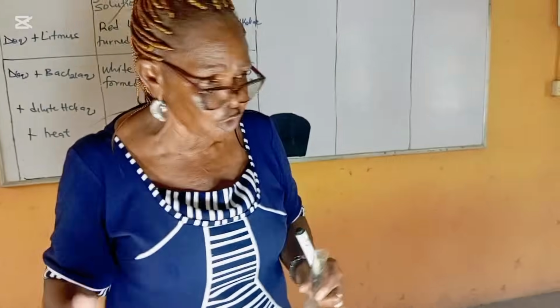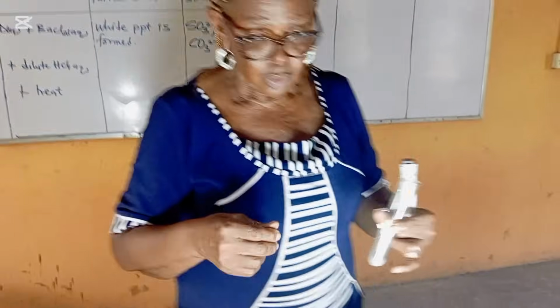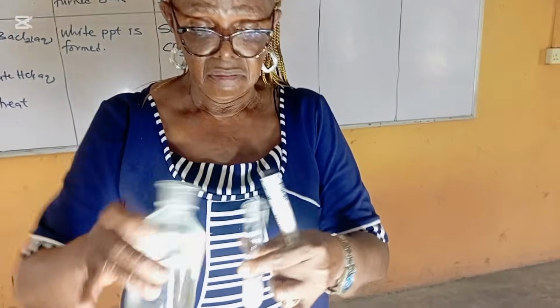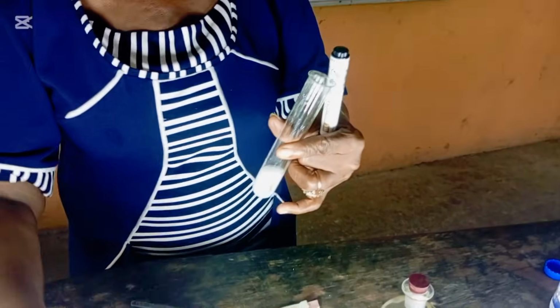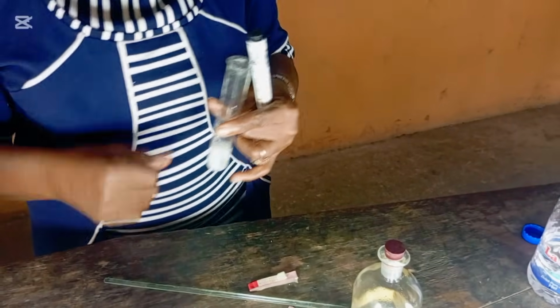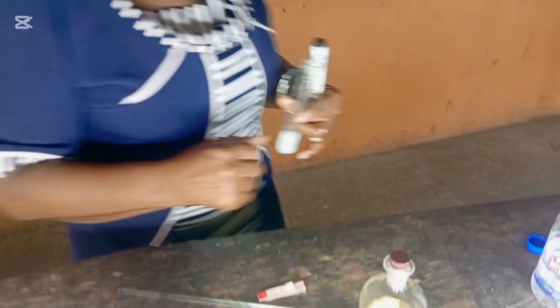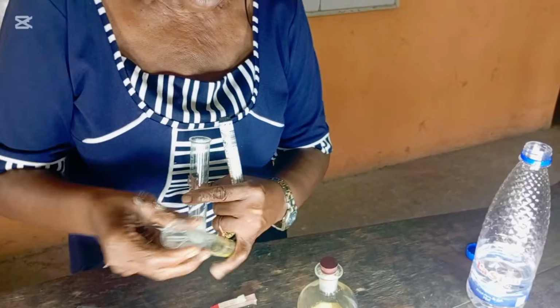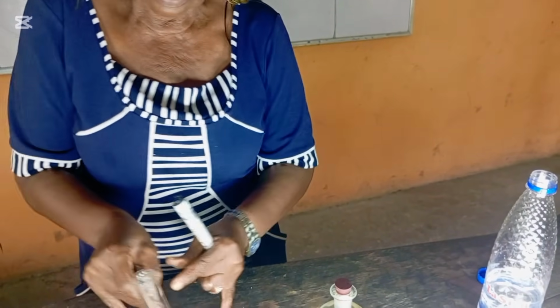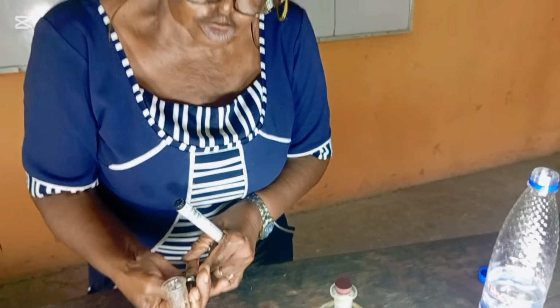You comment as usual. So where is the HCl? That's HCl. You now add the HCl, which is supposed to dissolve it. It did not. Probably they want us to go and heat it so that it will dissolve. So we're going back to do the heating. But if it doesn't, you go ahead and report. That is our adulterated salt these days. Heating.